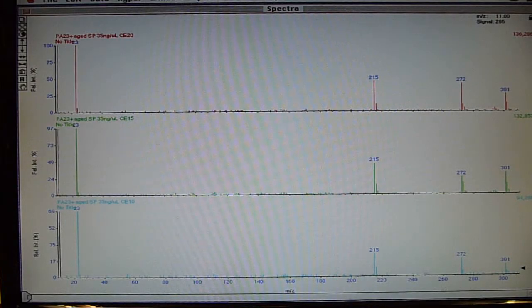And here we have three precursor ion scans. Q3 is, in this case, at 23. And we're scanning Q1 from 10 to 310. And there are three different collision energies, 10, 15, 20 eV. And you can see that in all three cases, 215, 272, and 301 are ions that have sodium associated with them. In other words, they're sodium adducts. These three are sodium adducts.